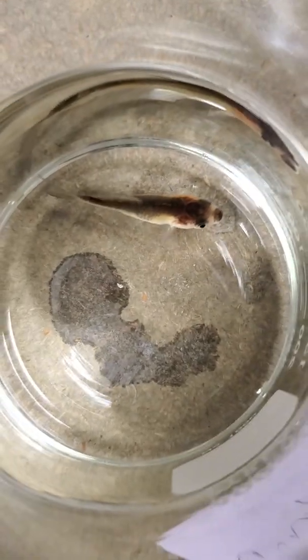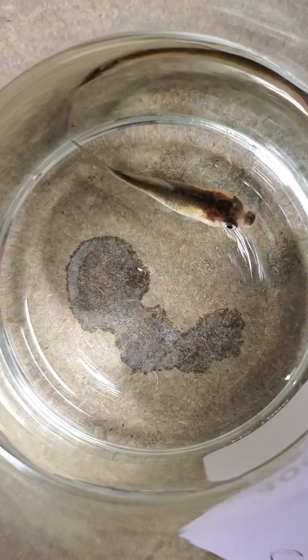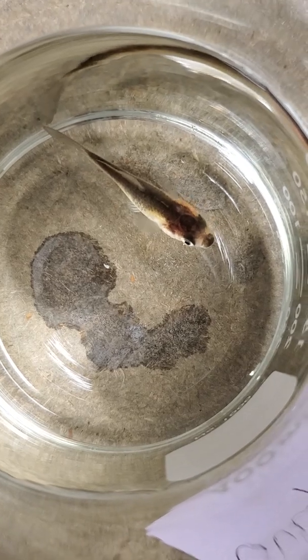And time. We're going to go back to our control goldfish. It is 18.1 degrees Celsius. And start.